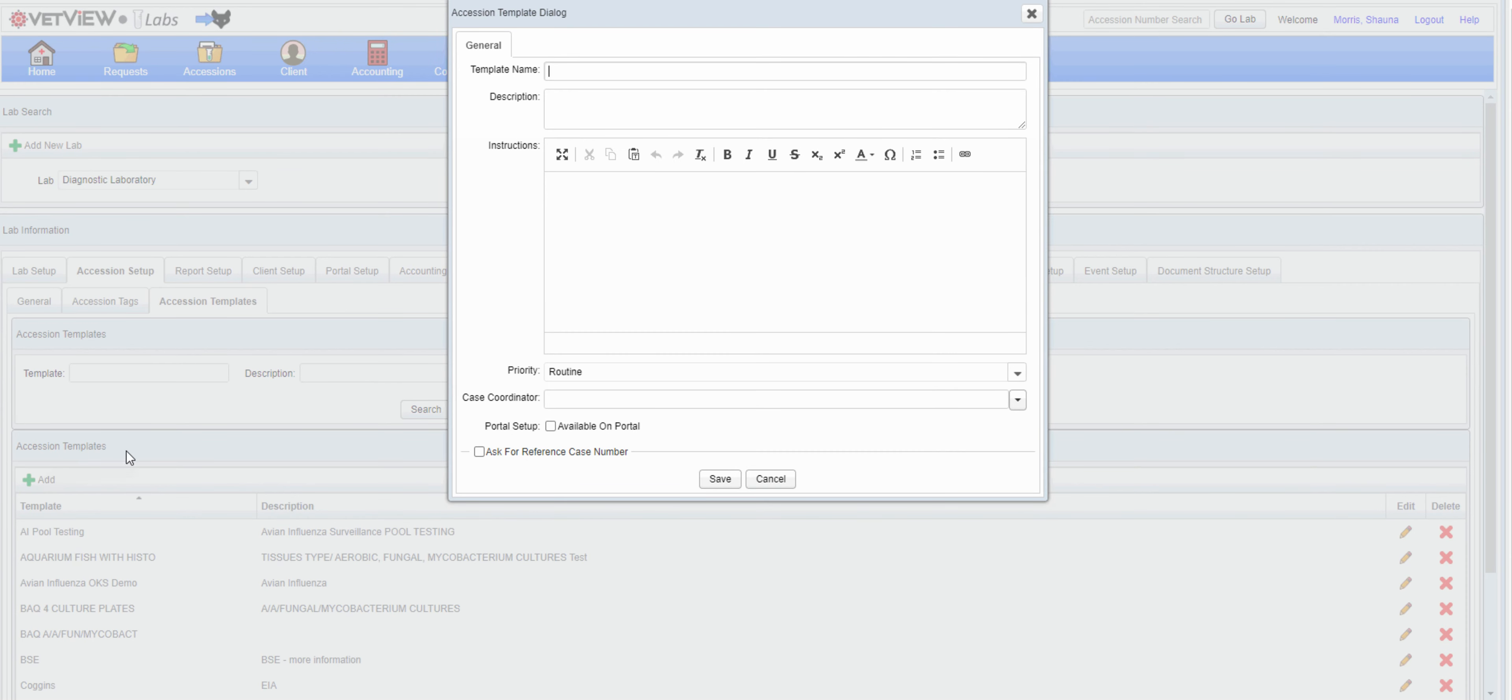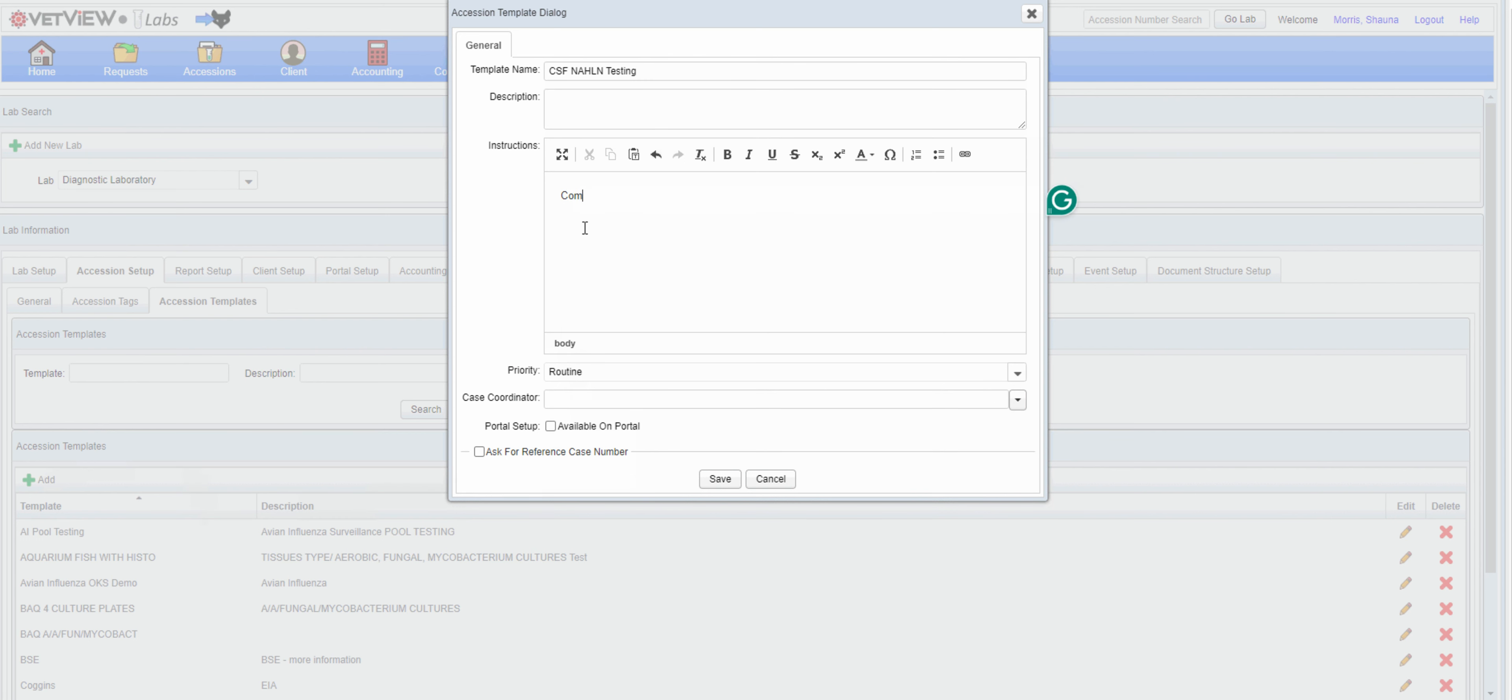VETVIEW offers custom accession templates to improve the accuracy and speed of case entry. This may be particularly helpful for disease programs where the data required varies from the traditional case. Templates allow for instructions for the individual completing the form and are also available for portal submissions.